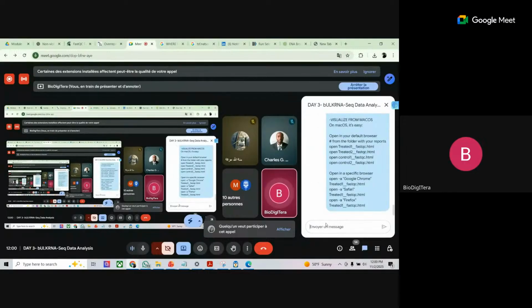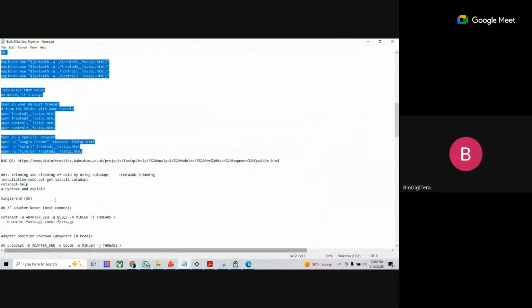That is everything that we have done today. And you can do that at home to play or run these commands, and watch this video to understand the explanation behind. Now we go to trimming.